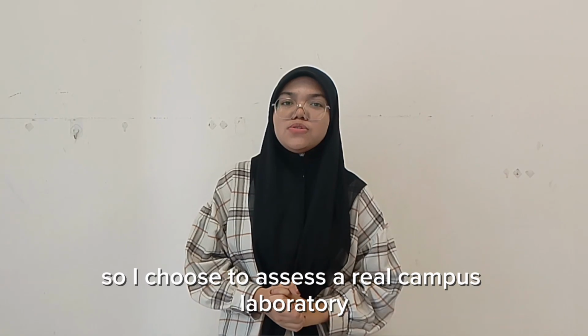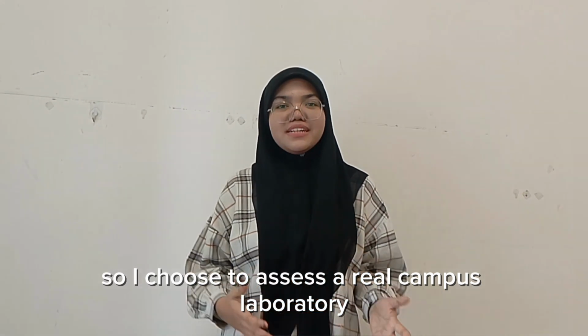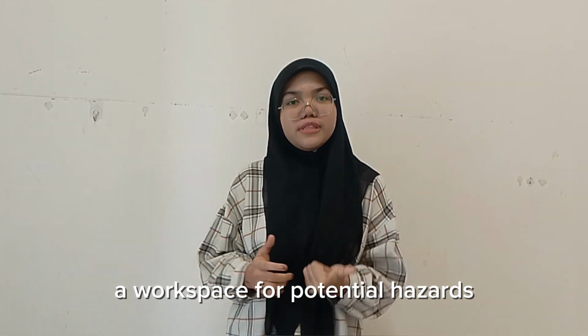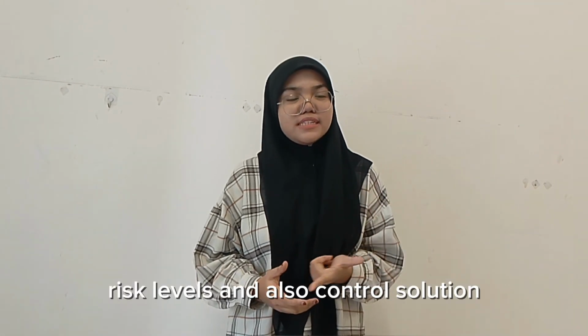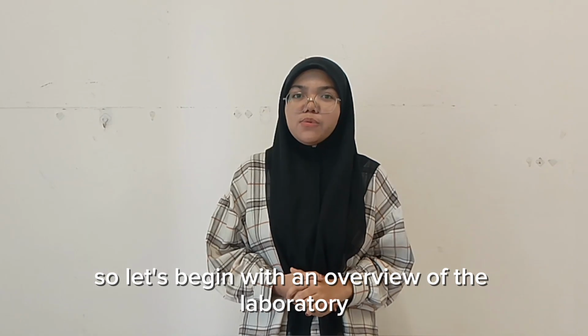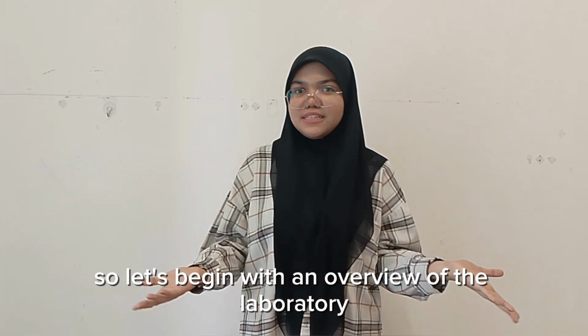So, I chose to assess a real campus laboratory workspace for potential hazards, risk levels and also control solutions. So, let's begin with an overview of the laboratory.